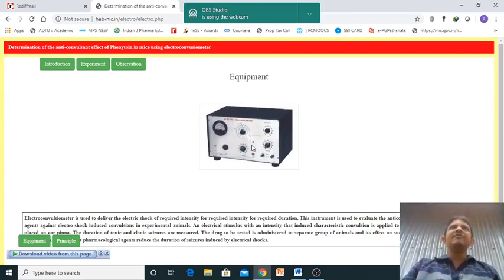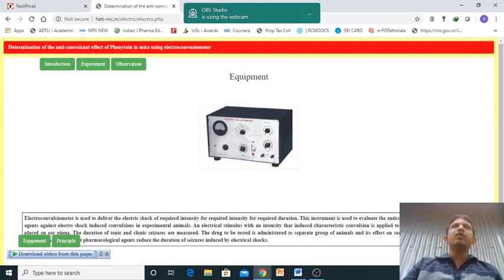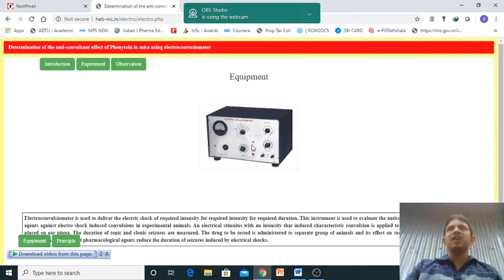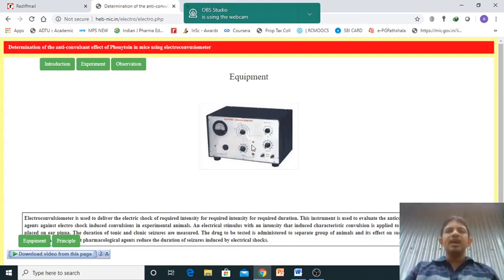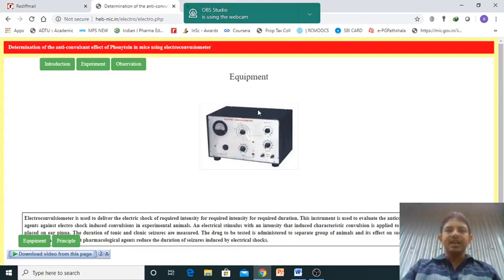What is the use of this instrument? We are giving the electric shock to produce the convulsion seizure, or you can say epileptic seizure, using this equipment.